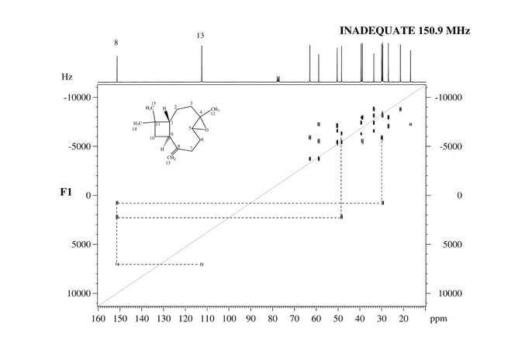So these two carbons here, we've got 8, these are already labeled, and 13 is the terminal one. Why are they easier to pick out? Because those are the only double bond carbons in the spectrum.